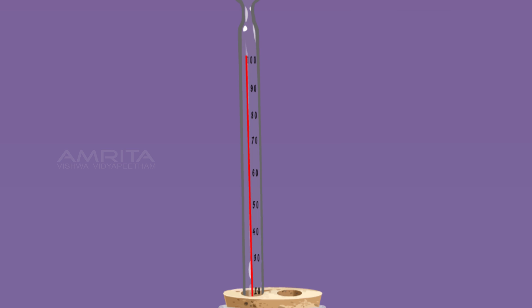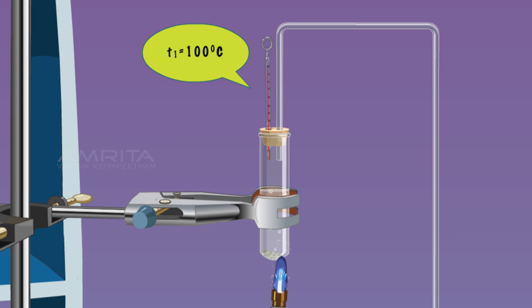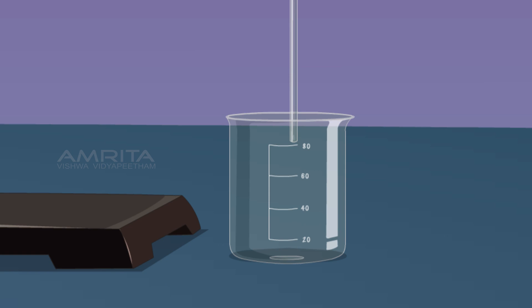On boiling, water is converted into steam which passes through the delivery tube, is condensed and gets collected in the beaker.